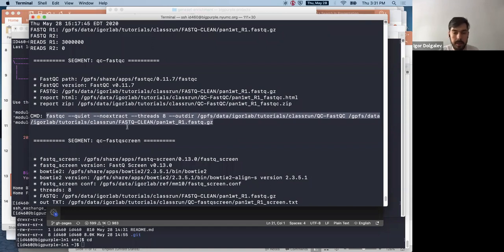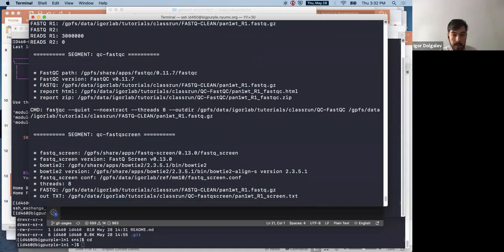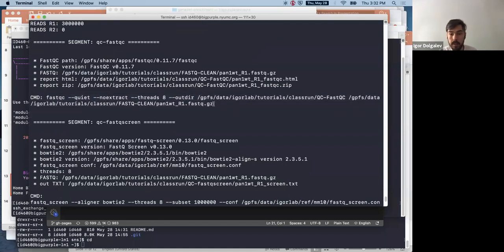And I think maybe you already see the pattern, which is that normally when you first start doing any kind of bash programming or any kind of analysis, you start with pretty simple commands, such as fastqc, and then you specify your output directory, and then you specify your input fastq, and then you run it. And over time, you might want to automate it. And so that's where you end up with something like a bash file.